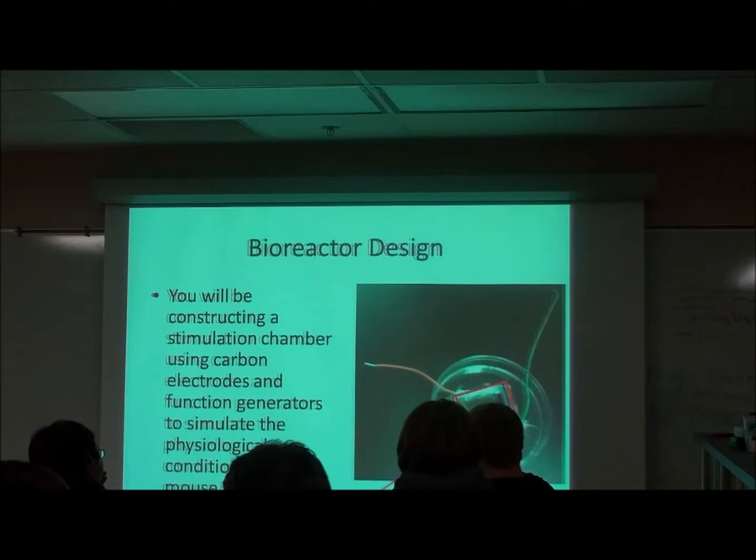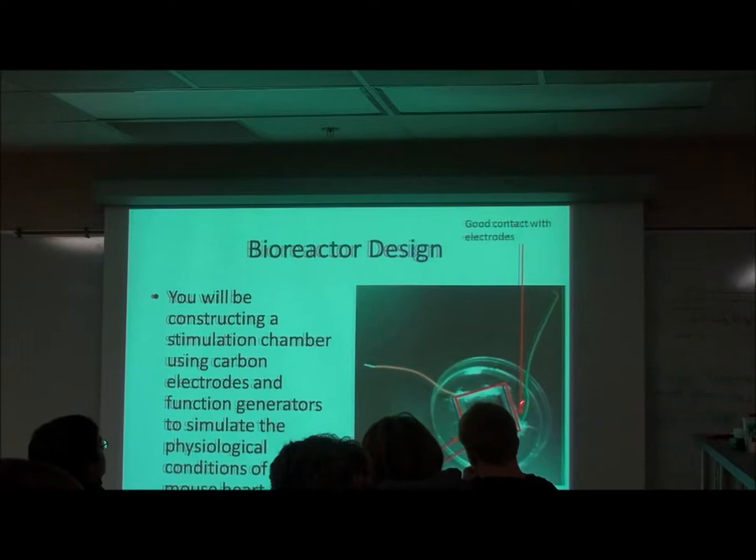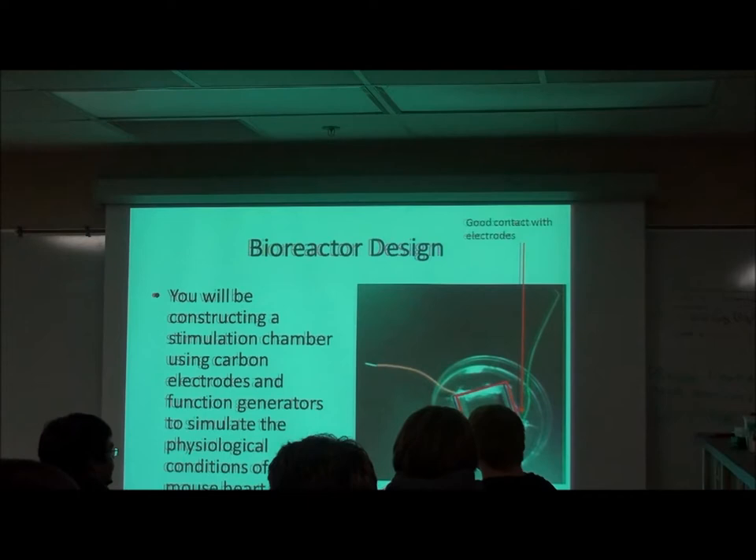The next important thing is that you form a watertight seal both below the carbon electrode and around it, and then in between the two to create a little well. That well is going to hold your cells, media, and cells. It's really important that it's watertight and that you have good contact with the electrodes. You want to make sure that you wrap at least one really good twist around the carbon rod.